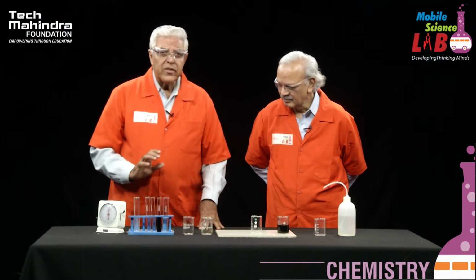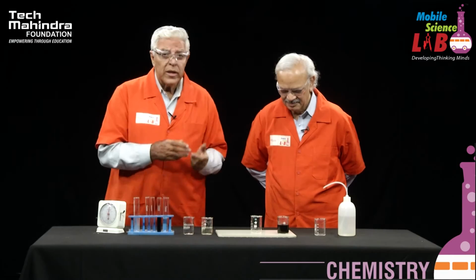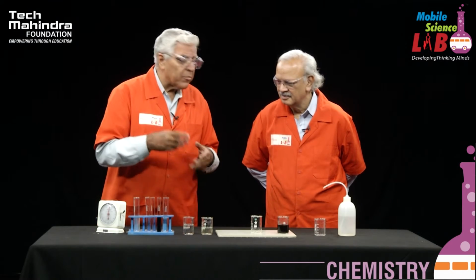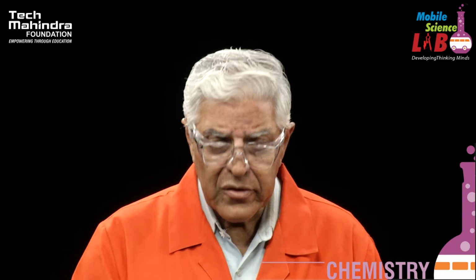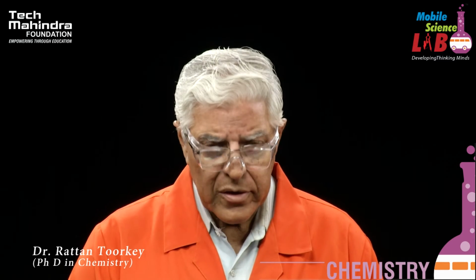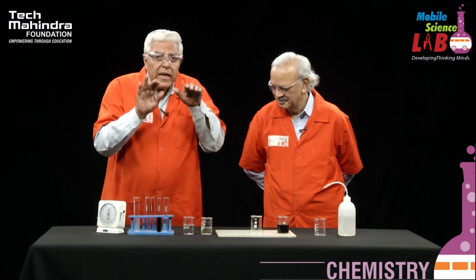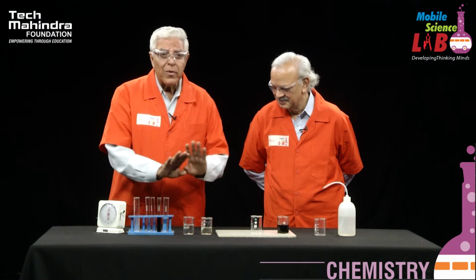A very simple summary is that the clock reaction is a fascinating reaction. The end point is a beautiful production of color. It's not necessarily blue. In our case it was blue, but it can be different colors for different reactions. We can study 3 or 4 aspects of the clock reaction. One is effect of concentration. If you use more of these solutions, the reactions will be faster. If you use more of hypo, the reaction will be slower. So this is one aspect.